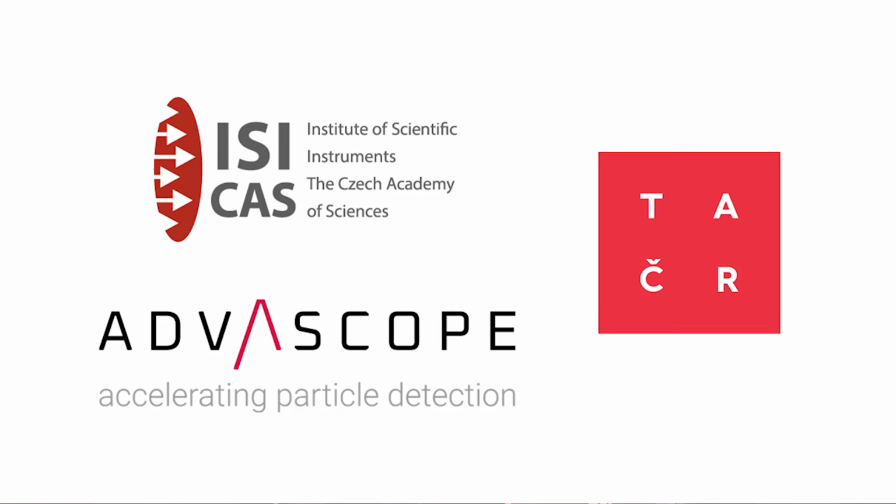And for the other projects, we have submitted a proposal to the Czech Science Foundation and also to an artificial intelligence program offered by the Technology Agency of the Czech Republic. We would like to go even beyond the limits of current software, and enhance it so that it could be used also for monocrystalline samples in a similarly simple way. So that's it. How important is it for a commercial company to collaborate with institutes and academia on these projects? For us, it's a very valuable collaboration, because you get the insight from the end customers as well.